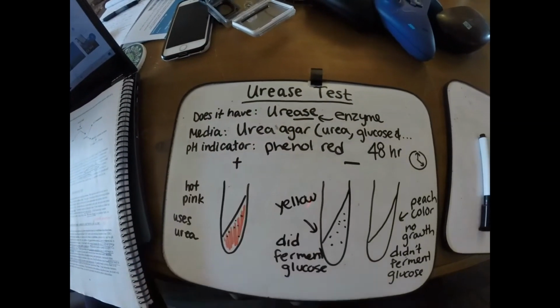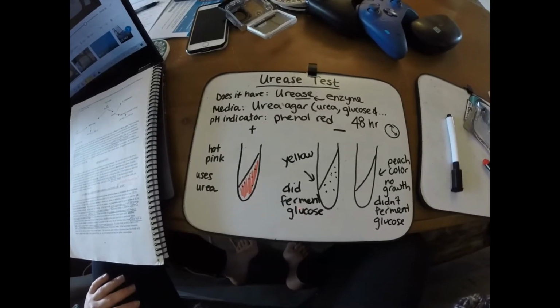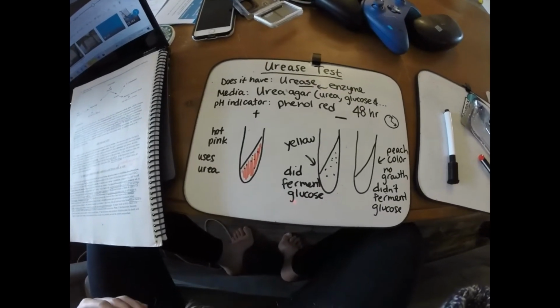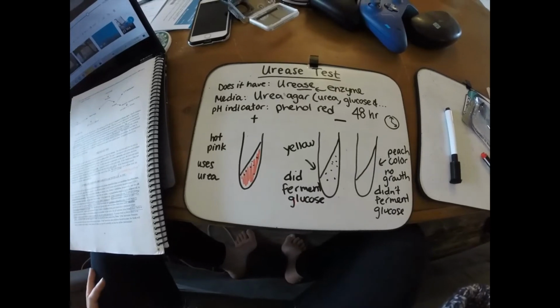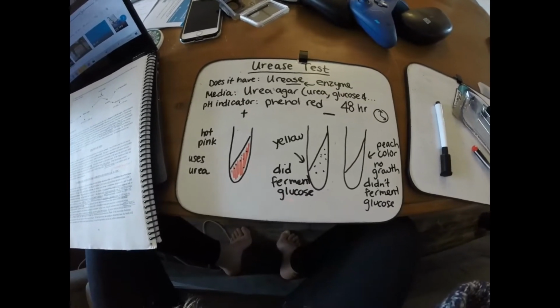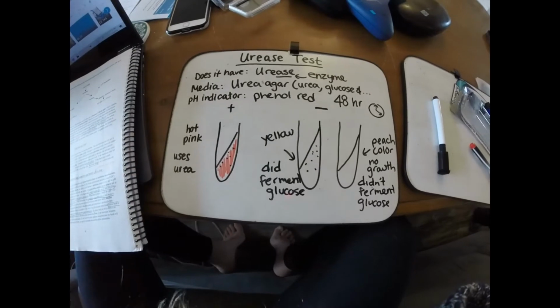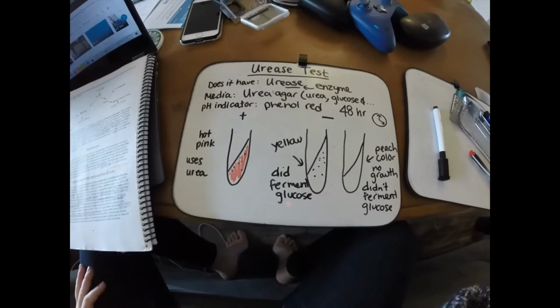So as you can start to see a pattern here, we're looking at, can a bacteria do something? Does it have that enzyme? Does it not have that enzyme? Different ways to be able to differentiate them, which will be useful for your unknown project. So start kind of thinking about all of that and how these different elements can be put together to narrow down an investigation.